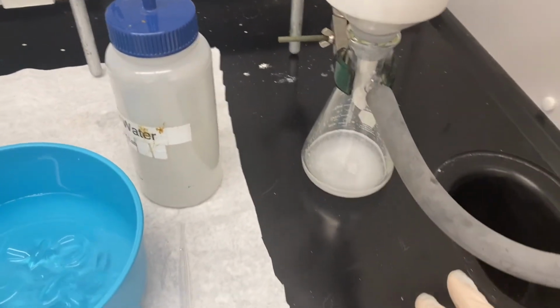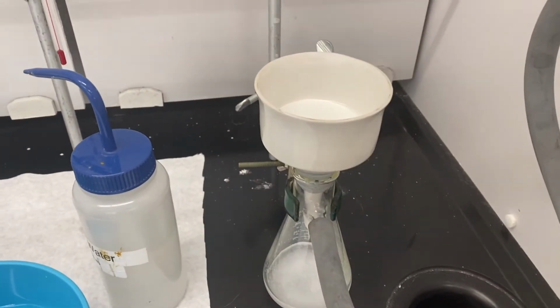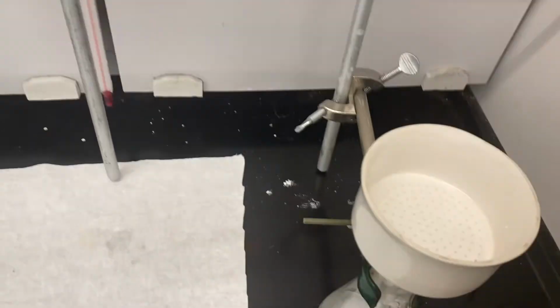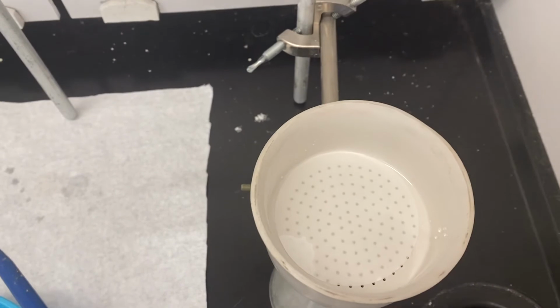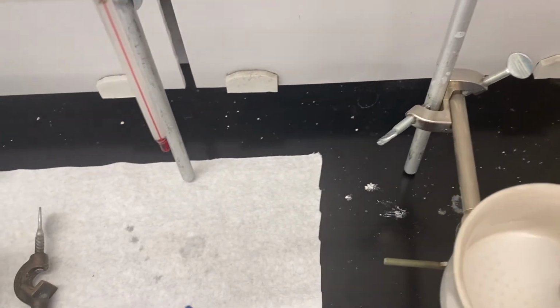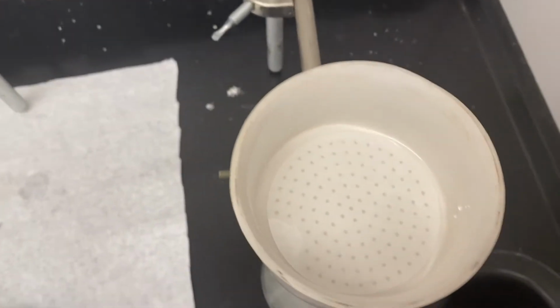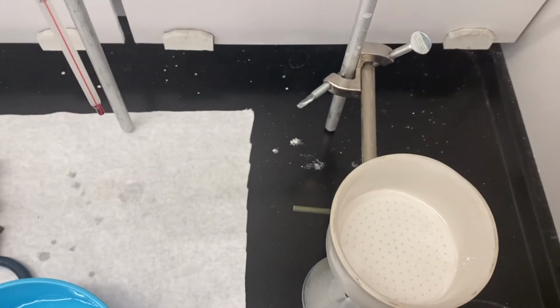I didn't switch out my filter flask, but everything we want should stay on top. So I'm going to start my vacuum line. You can hear it hissing. And we of course want to wet our filter paper before we filter to make sure all holes are covered. See that there are some holes that aren't covered. So I'm actually going to turn my vacuum off. Release that pressure and kind of move this over so that everything is nice and secure. Start my vacuum line. So everything looks good.